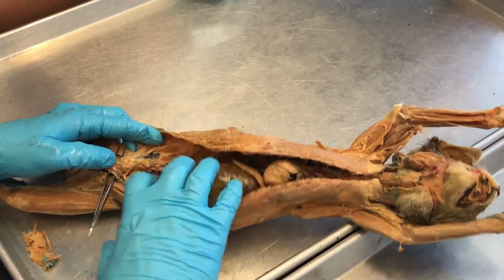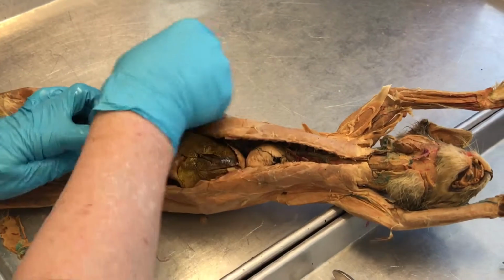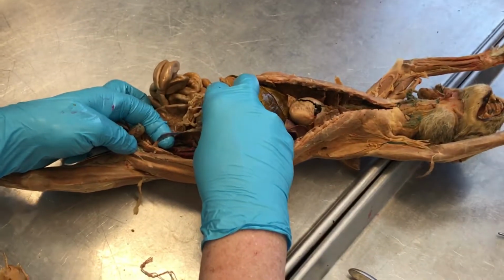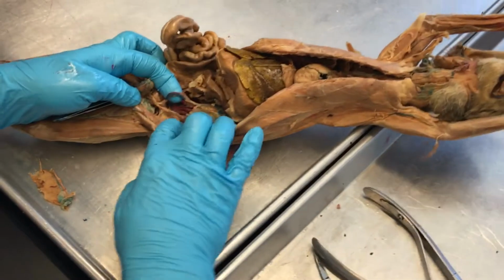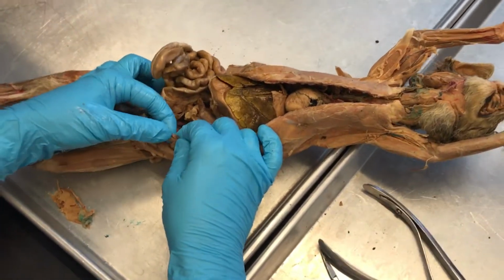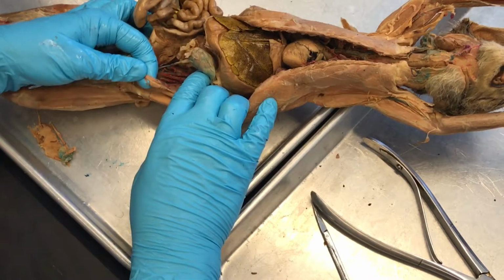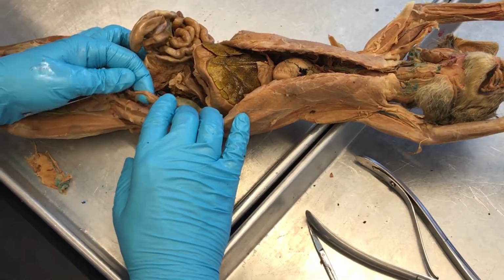And since he mentioned the kidney, let's look at what goes up to the kidney. What would that be? That would be the ureter. So here is the ureter. Luckily, it has a blue vein on it, so we can see the ureter pretty clearly. How can we tell that's not a uterus? Well, we have to go to the end of it. This uterus has an ovary at the end. This ureter has a kidney at the end. So if you're in doubt, check for a kidney or an ovary.